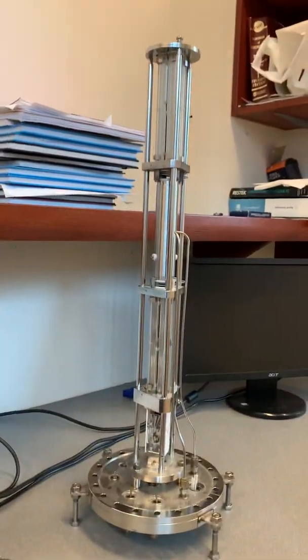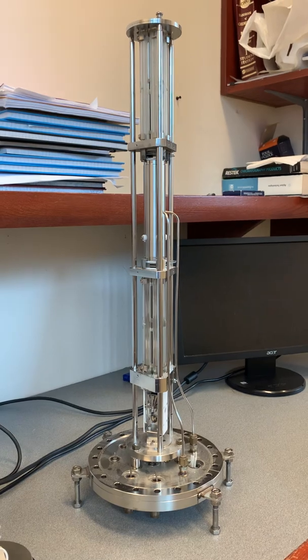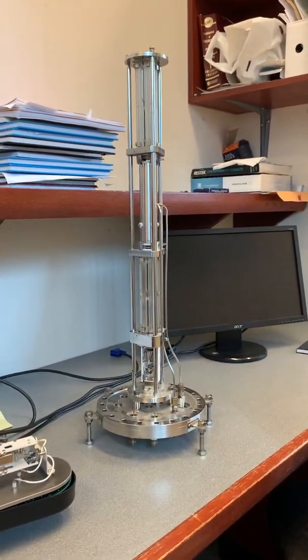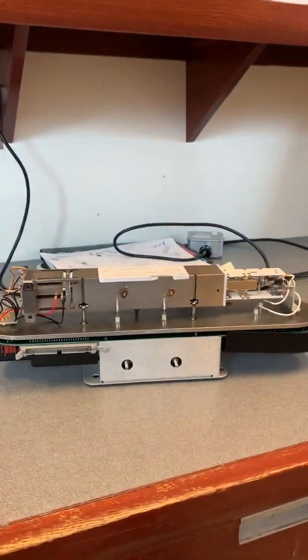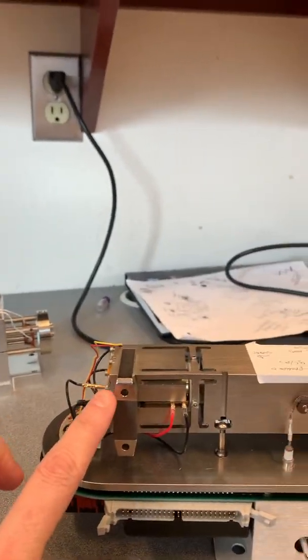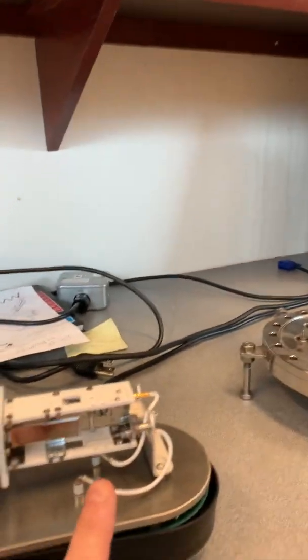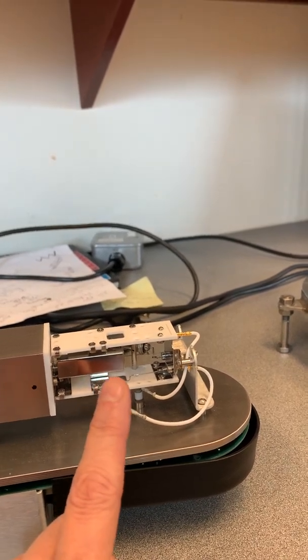Most of you will be familiar with single quads because your LC's and GC's generally have a single quadrupole — they are cheap, and hence the reason they are so popular in many analytical labs. This is the internal workings of a single quad that you would find in a GC mass spectrometer. We have the ionization region here, and once we've made ions we need to separate them according to their mass-to-charge ratio, which the quadrupole does. Then we detect those ions to know what abundance we have of any particular mass-to-charge.